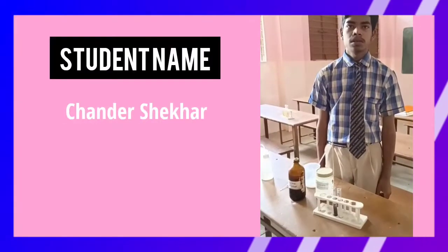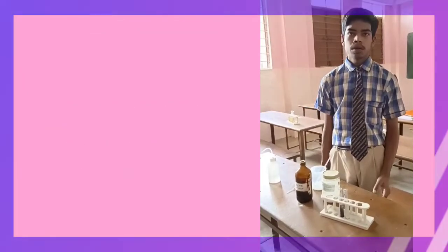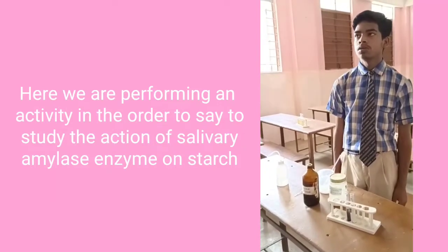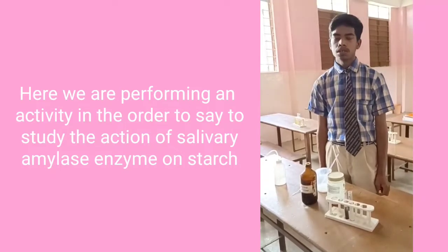I am Chandrasekhar from St. Thomas School from class 10th. Here we are performing an activity in order to study the action of salivary amylase enzyme on starch.